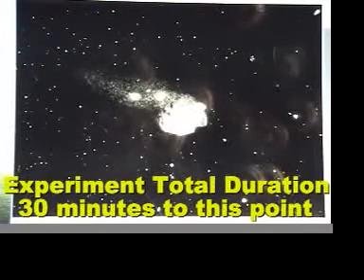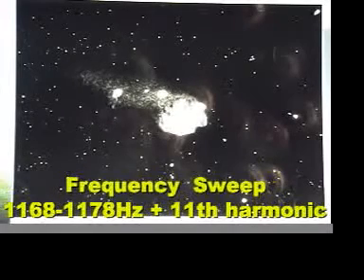But we have also seen that frequency affect other organisms. This organism along with many others on the slide underwent a series of exposures, approximately three minutes each, starting at 1168 hertz and running through 1178. That is a timer telling me the entire duration of the experiment so far for this organism has been 30 minutes. We began to see the shape change around 1177 plus the eleventh harmonic.